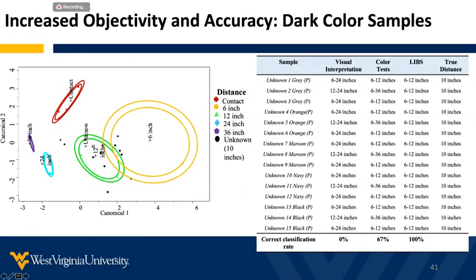The chemical information was used to train linear discriminant models, and we use unseen data that we call blind unknown data because it's blind to the analyst. So they don't know what is the distance that we have been shooting. We provide the samples, they do the analysis, and they use the calibration data to test how well these models can predict a shooting distance. So we keep it blind to the process until they submit the results, and then we can evaluate how well the methods perform.